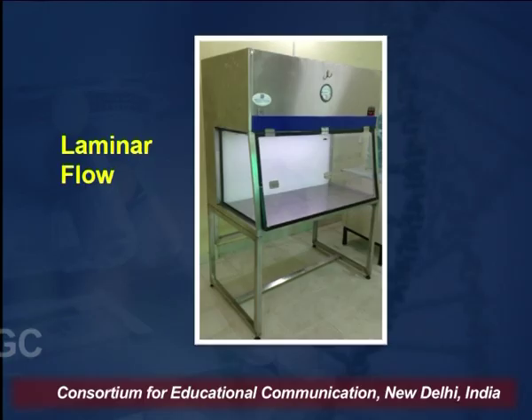So, this is the structure of the laminar hood. This is the workspace for all the microbiology experiments, because for a microbiology experiment you want to culture only the species of interest. You do not want any other contamination. So, you use a sterile space. The function of this laminar hood is to provide that sterile space.